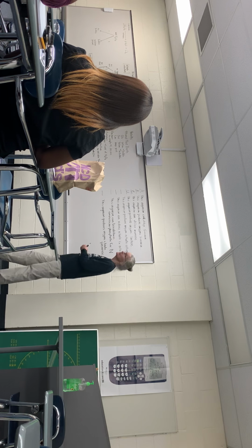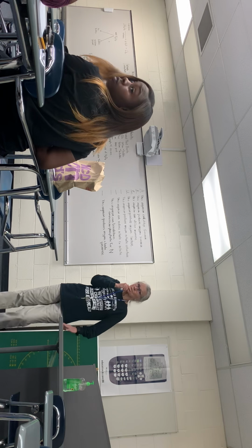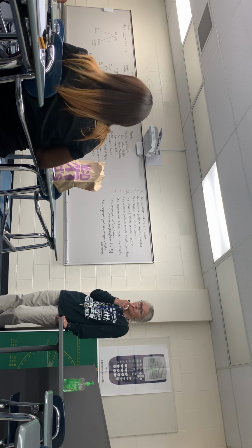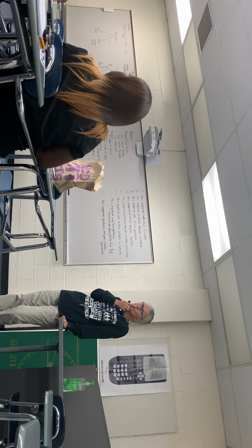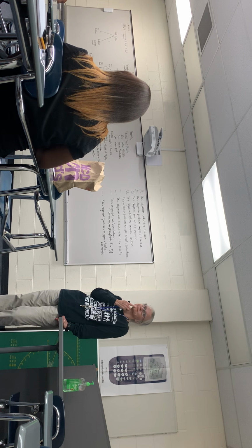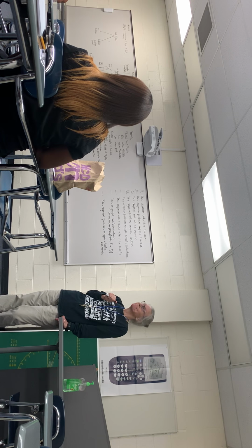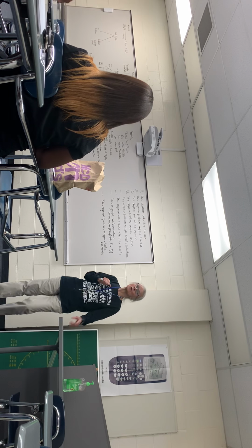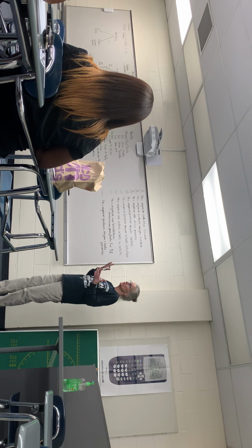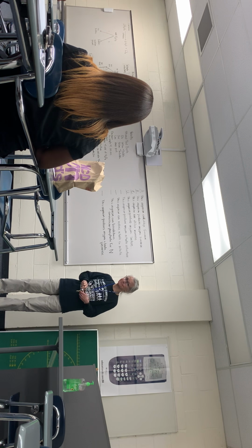Yes, ma'am? I have a question. On that one, you said it's not taking advantage of the lactose, and I thought I understood it over here. So if it were to turn yellow, it would show that the carbohydrates are present, so it's using it. Right. Pink means it's using the peptone. Yellow means it's fermenting whatever carbohydrates are in that test tube. So in order to know it's using the lactose, our lactose test tube would have to turn yellow.